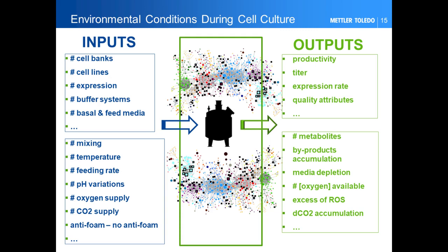Cells have to adjust continuously to their environment. Even if sometimes a bioreactor might sound or look like a black box, mapping inputs and outputs while trying to characterize the factors that influence performance at scale is an approach helping to improve the performance of a process with defined process parameters.